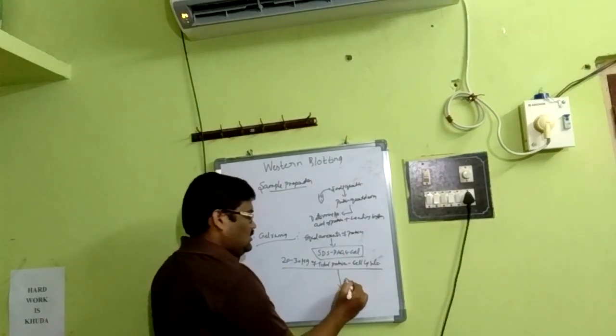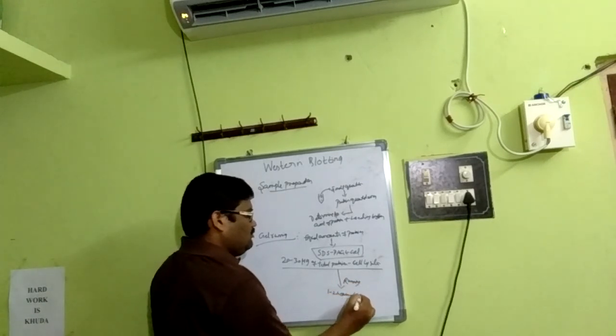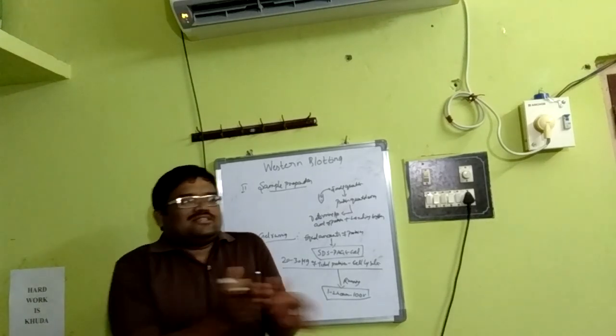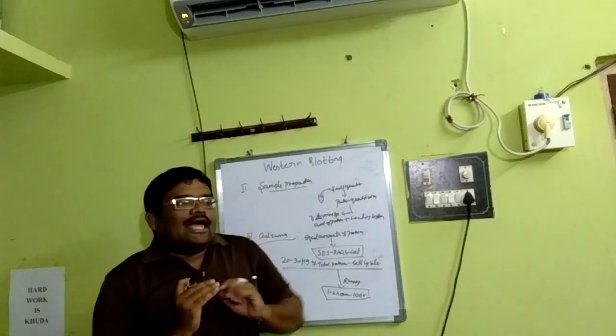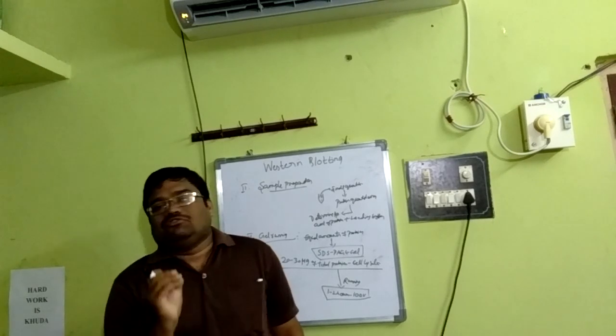Run the gel. Running, say, for 1 to 2 hours at 100 volts. This is called running the gel. Allowing that means the sample has been subjected to the SDS-PAGE gel, and allowing the same for 1 to 2 hours at 100 volts.